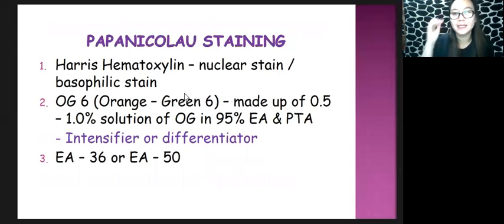Now, this is actually our concern because in the laboratory, we usually receive vaginal smears. The smears are already made when we receive them. So our job is to perform fixation and to perform Pap staining. Since this is cytology, the recommended stain is the Papanicolaou staining, or Pap staining.